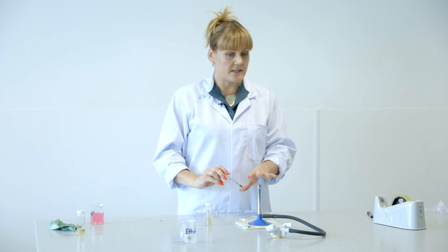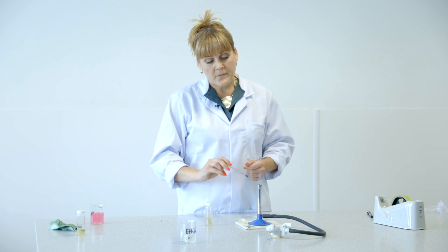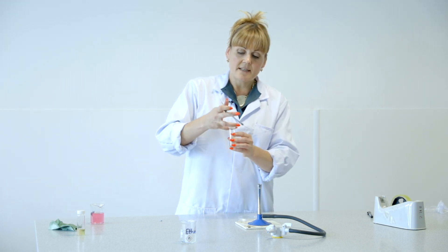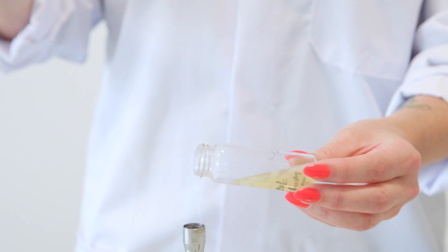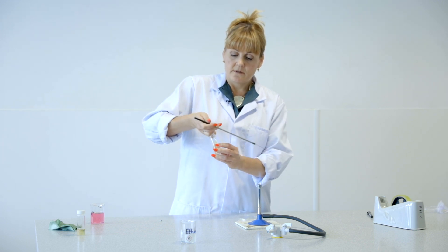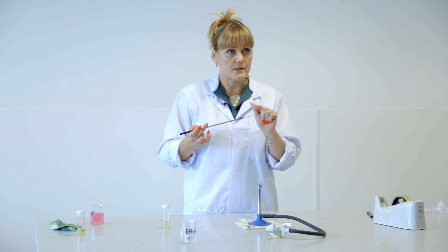Don't put it back on the bench because then it would be contaminated. If I place it in the upthrust of the outer part of the flame, it will cool down. This is the technical part, but you will learn how to do it on the course. I'm going to place the lid between two fingers, flame the entrance of the slope, take a small sample, flame it again, and close the lid. I now have B. subtilis on the inoculating loop.